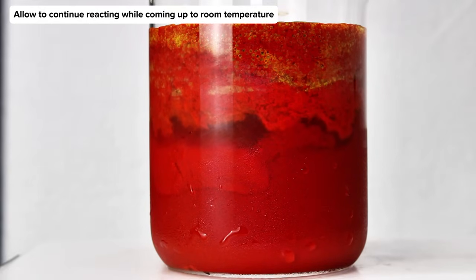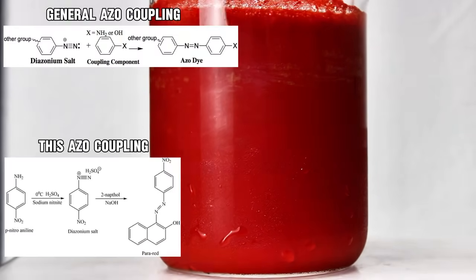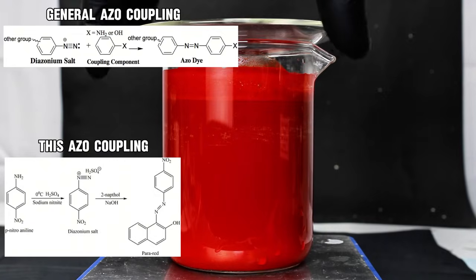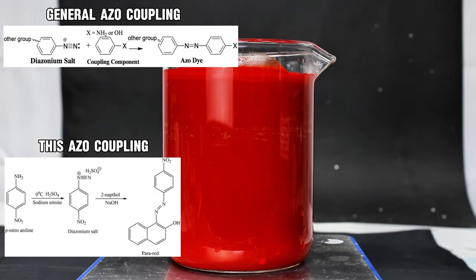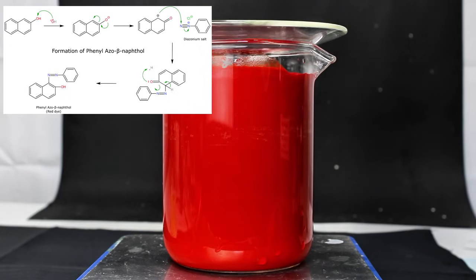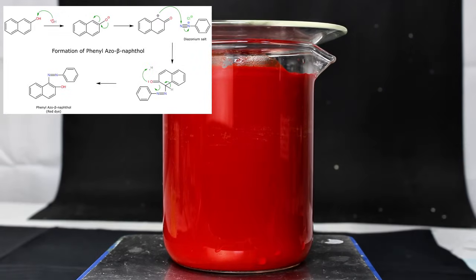While this is doing its thing, I'll try to quickly explain that second reaction, which is a textbook example of an azo coupling. This is a basic EAS reaction wherein the diazonium salt is the electron-deficient electrophile, and 2-naphthol is the electron-rich nucleophile. The hydroxyl group of 2-naphthol is a strong ortho and para-director, but since para-substitution is impossible here, the diazonium salt exclusively binds to the ortho position. That's the entire process, and honestly these types of reactions are generally pretty simple and straightforward.